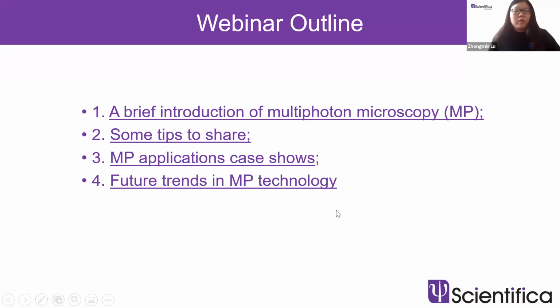In the second part, I will share and discuss some tips with you. These tips come from my own research experience, as well as the experience of my top-notch colleagues and friends. And the rest of the parts are for more fun. I will show you fantastic classic representative examples of how scientists use multiphoton microscopy to address their complicated biological questions.